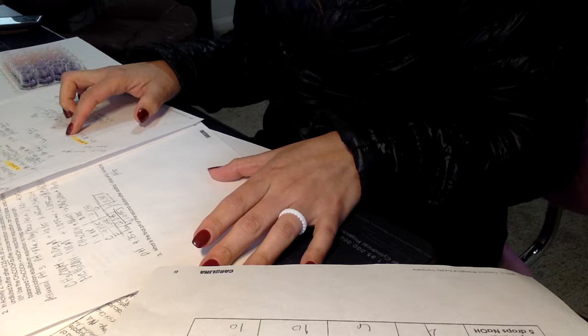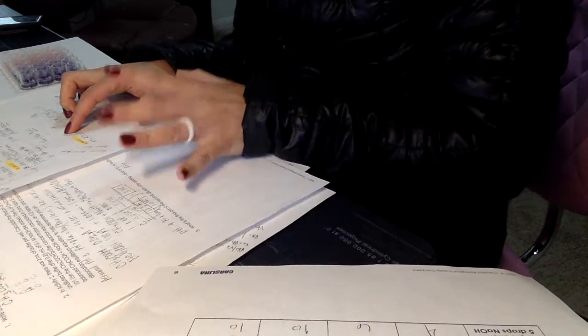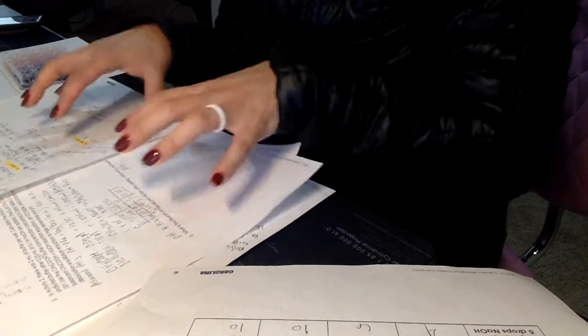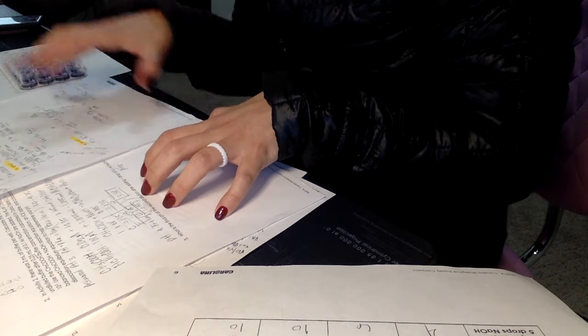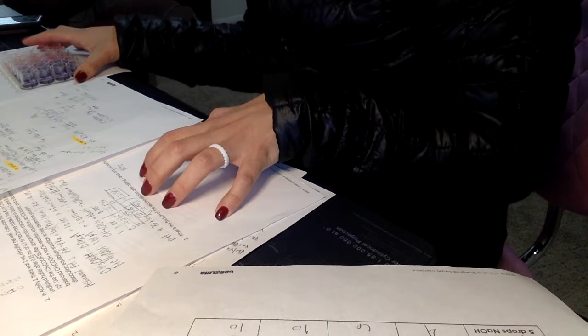So in order for me to find out how much of the product I was going to be using, I did this a little bit backwards. I started with the calculations, and that way I got this amount to grab the product and use it for the lab.